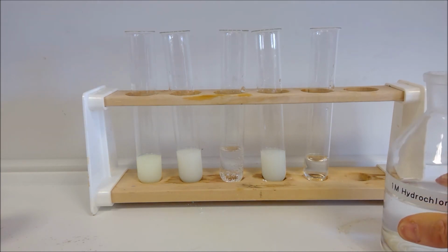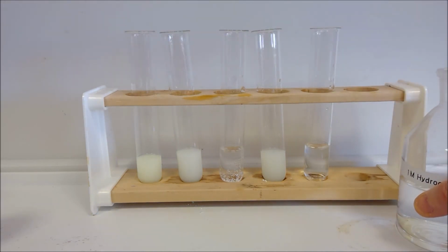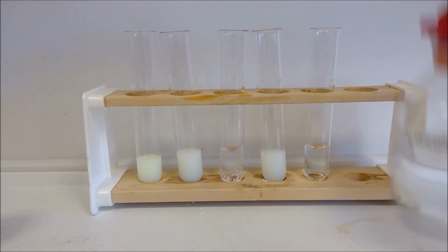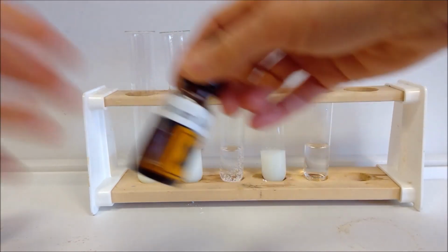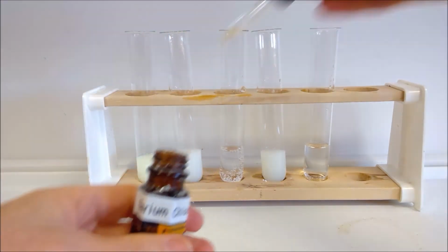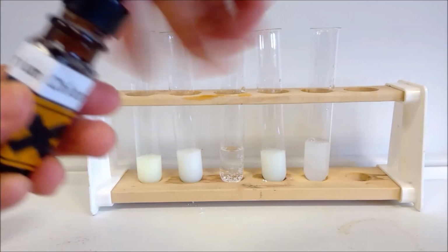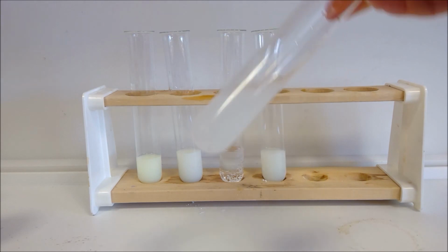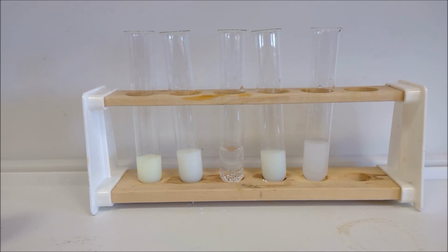So in testing for sulfate ions, we add hydrochloric acid this time because we're going to add barium chloride. So we always make sure we're not adding unnecessary anions as well. Okay, so like we'd expect, similarly to the nitric acid, there's no reaction there. And then adding our barium chloride. There we go. So note down your observation and then complete your conclusions with the identification of the anion in each of the different compounds.